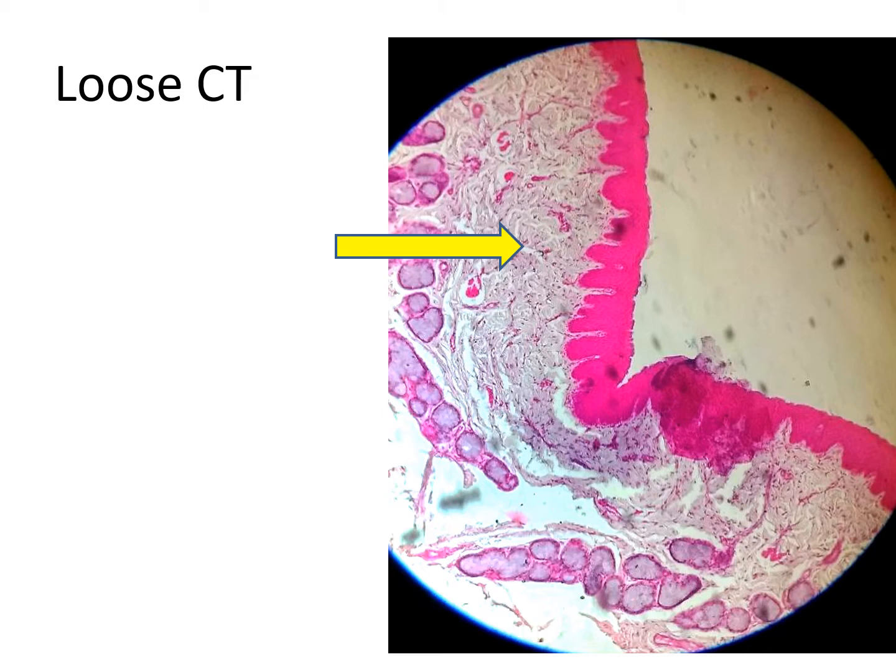It is classified into different connective tissues. The first classification divides it into connective tissue proper, including loose connective tissue and dense connective tissue. There are two types of dense connective tissue, regular and irregular, and embryonic connective tissue, mucoid connective tissue and mesenchyme. The specialized connective tissue may be cartilage, bone, adipose tissue, blood, and hemolymphatic tissue. So these are the classification of connective tissue.